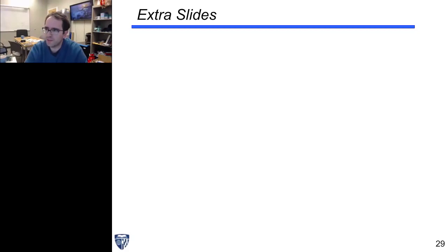We think there's going to be some limit where it's going to become too difficult to successfully capture and keep our on-target percentage, keeping the number of things that map to the right area, capturing the right DNA. It's going to become hard as we get longer and longer. There's also going to be diminishing returns from how long we really need to capture. But we think we can definitely get longer than 2. We're confident we can get 5. We're hoping to get 10 kb long. Thanks for the question.